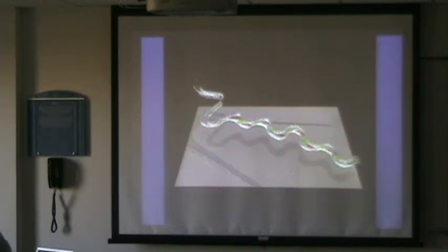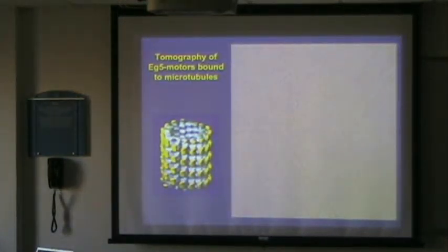Two more slides. This is now again just the tomographic reconstruction of microtubules. So you see we get quite a bit of, now of course there's no averaging involved here, unlike this one here, that's a helical reconstruction. So blue is the tubulin, and these are these kinesin heads again. Here we see the kinesin heads as these little blobs, and we can actually go now up and down.